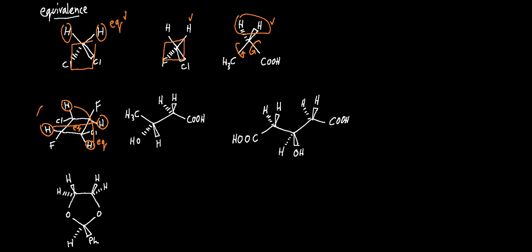Again, the next example really is the same argument with free rotation. These two are equivalent. Of course, an individual proton like this is unique and equivalent to itself. Same with that one, and same with these three. The three protons on a methyl are always equivalent to each other, equivalent to each other.